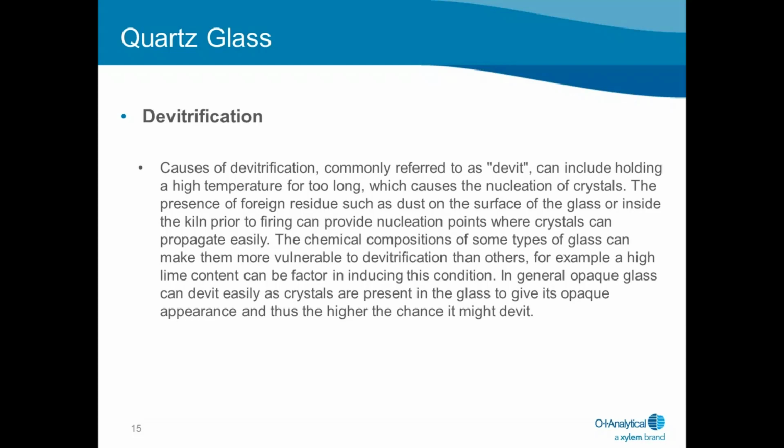For quartz glass, the process of devitrification occurs when quartz is exposed to salt-containing liquid at high temperatures, just like we have in a combustion TOC. The combination of heat and salt lead to devitrification. This process is accelerated if either the salt concentration or the temperature is increased.